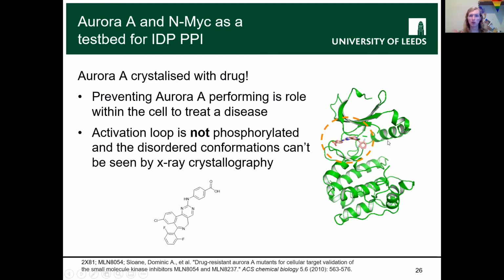So what we're looking to do is mix structures found from crystallography and use cross-linking mass spectrometry to understand the interactions of proteins that have intrinsic disorder and their interactions with stably folded proteins.